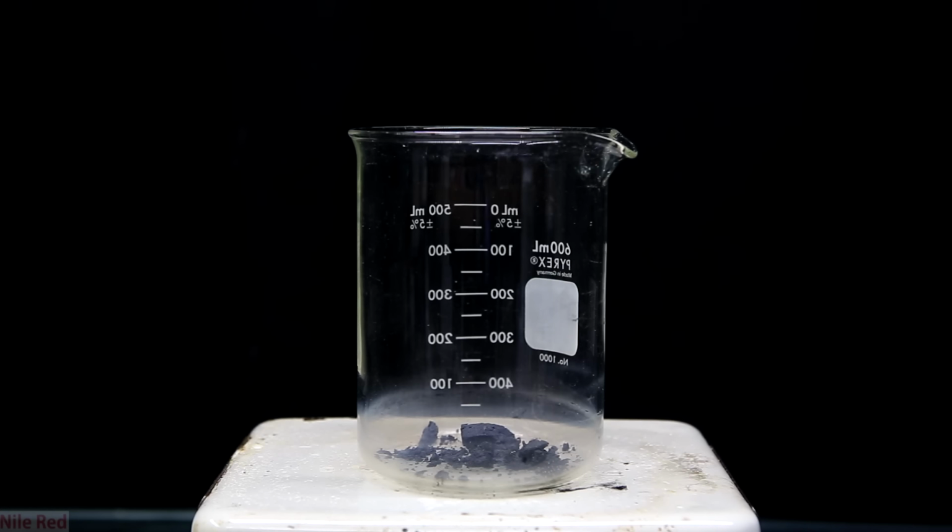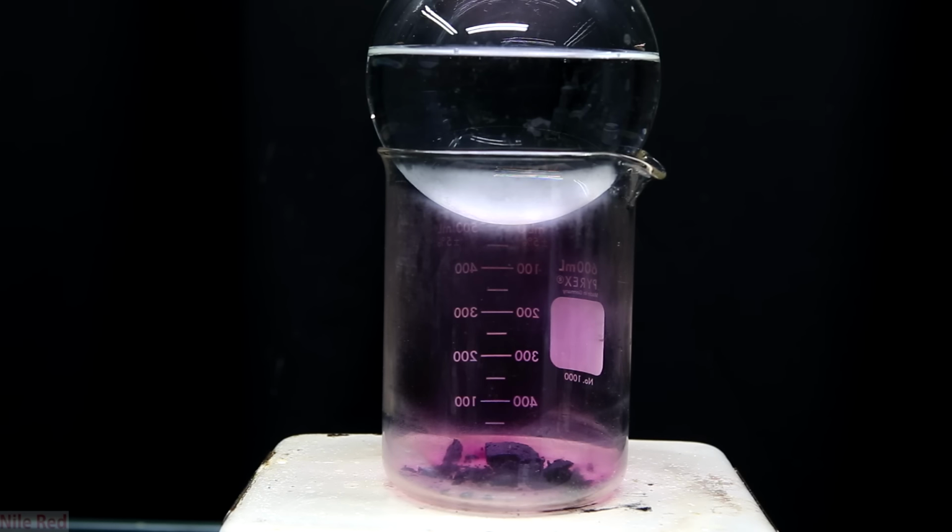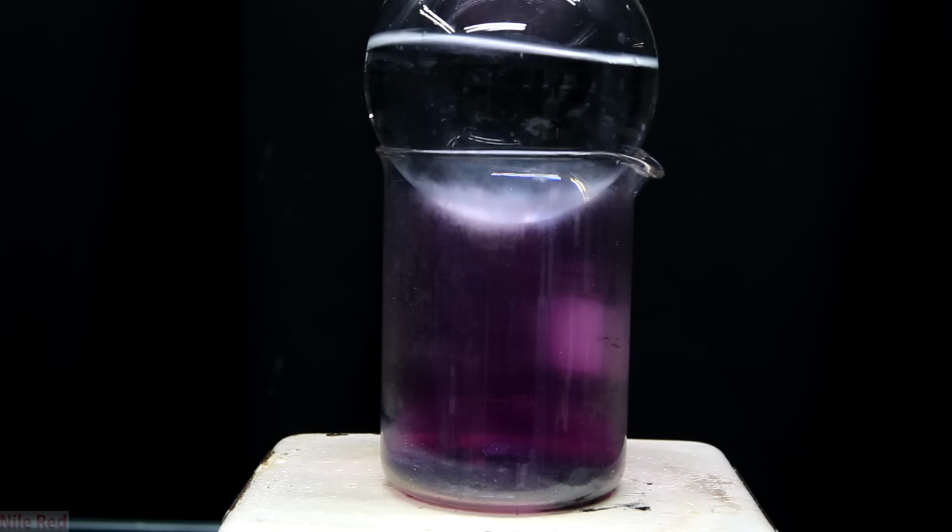The first step in this process is to place a flask of cold water on top. We can then start to heat the beaker, and you'll see a lot of vapor coming off. As we continue to heat it more, the color will get stronger and stronger.